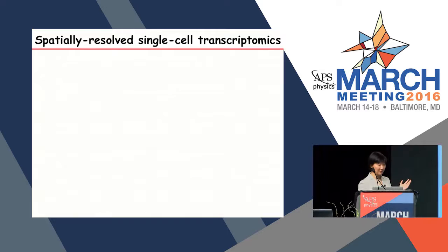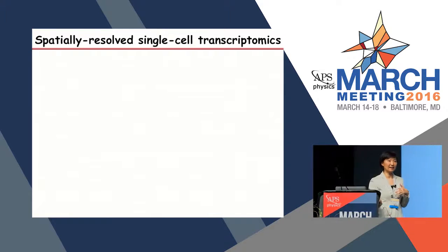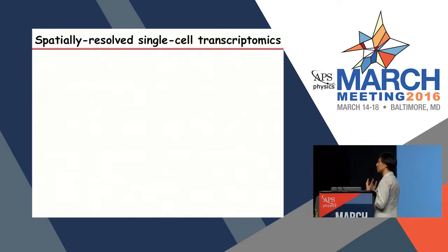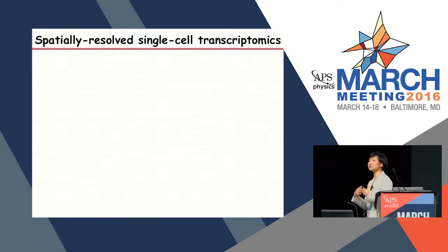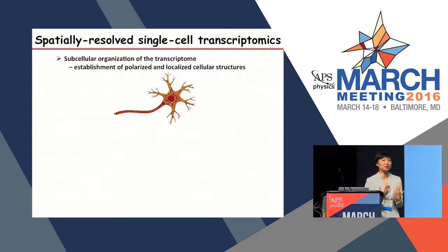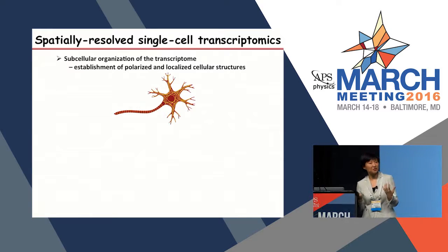And indeed, that's already known to many biologists, and there are already very powerful approaches doing that, called RNA sequencing or single-cell RNA-seq, which the next speaker, Weissman, is the expert in. I don't know whether he'll talk about it. So with such powerful single-cell RNA-seq, you might ask, why do you want to develop a different, imaging-based approach to do that? The reason is that we can get spatially resolved information. Within cells, these transcripts or RNAs are not uniformly distributed. Their non-uniform distribution is very important for local structure formation and maintenance.